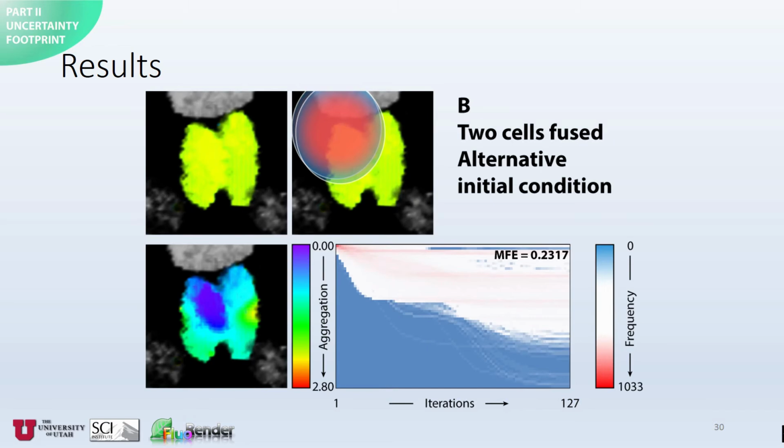Example B uses the same cells from the first example. The difference is that we changed the initial condition. We started with two Gaussians overlapping with each other. The result seems chaotic for both the color-mapped rendering and the histogram. The non-uniform behavior of this example is clear. It seems that the algorithm didn't know where to put the two Gaussians. The curves represent regions that cannot converge quickly. Their effects propagate to other regions and cause the entire result to become uncertain. In fact, the segmentation result in this example was incorrect, as the EM process was trapped in a local maximum.